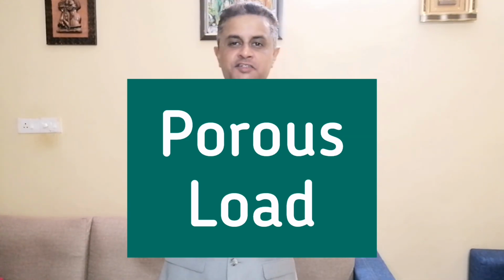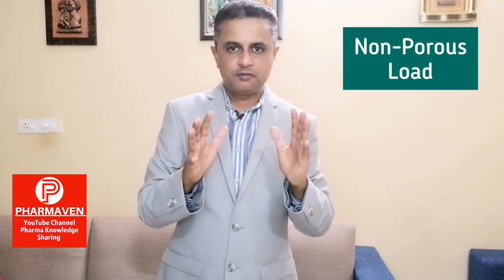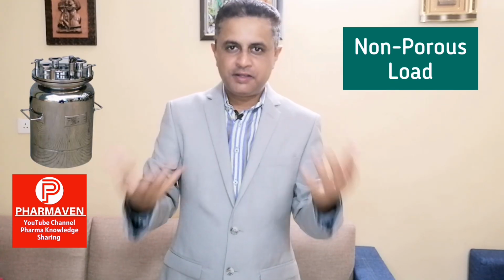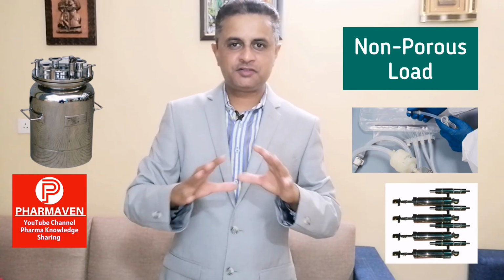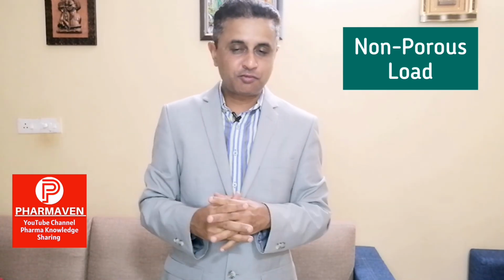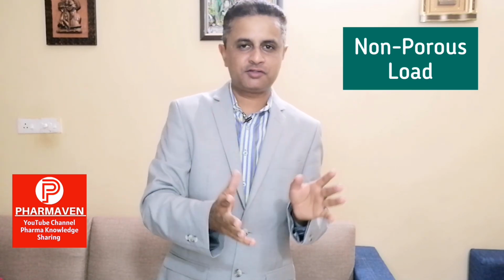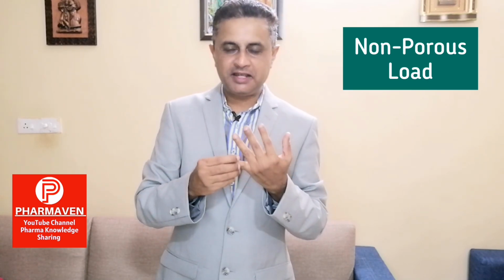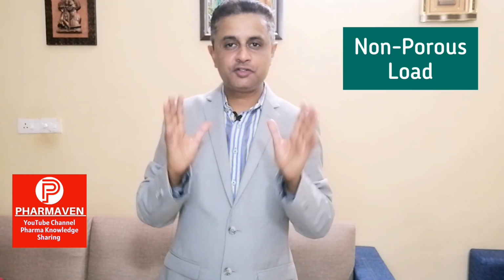Now once we understand porous load, we'll discuss what a non-porous load is. Loads such as vessels, filling assembly, syringes, which are pure metal parts which don't have pores. Bottles, glass bottles, open glass bottles, such loads which have no pores, which are solid. It can be metal, it can be glass, it can be any other item, but it is solid.